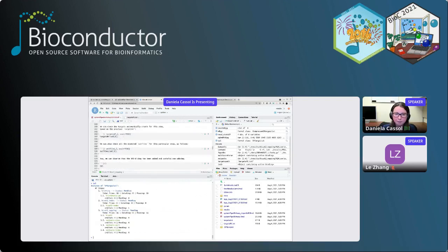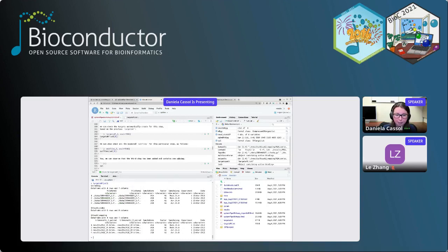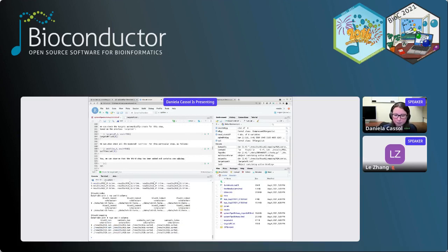Okay, and then one of the things we can quickly look at is the targets, let's print this. If the targets are now okay, right? If that connection happens in the right way. So the file name 1 and file name 2 are here because of the first step. We use that file from the disk. However, here on the mapping, you can see now we are expecting that out file from the first step. Also, you can always check the out file. So here, and then we see all those 4 files and everything.